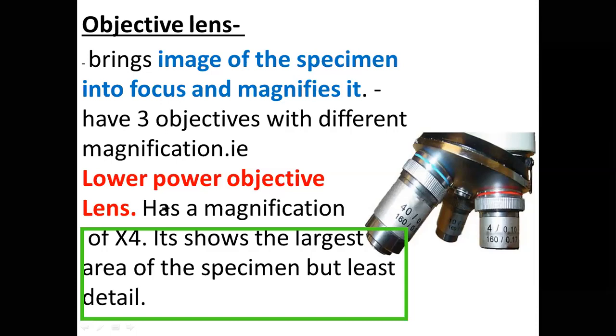Yeah, technology inakuwa na vitu na mambo. So I was saying the lower the magnification, the wider the field of view. The more you go down, and you can see now my hands are opening up, the wider the field of view. And by that I mean you see more cells and you don't see details. So that's now the other aspect. You see a lot or even larger part of the specimen, you see more cells, but for details they become less and less. The resolution becomes less and less.